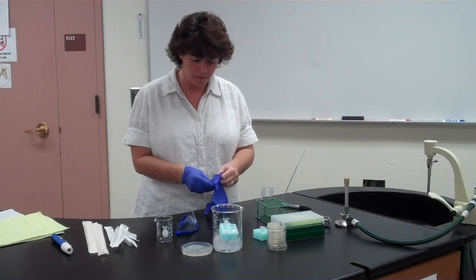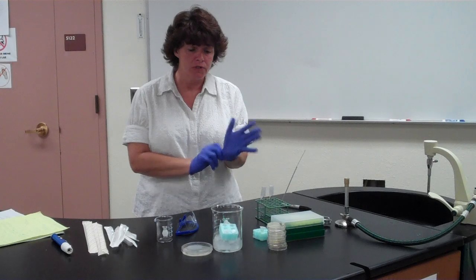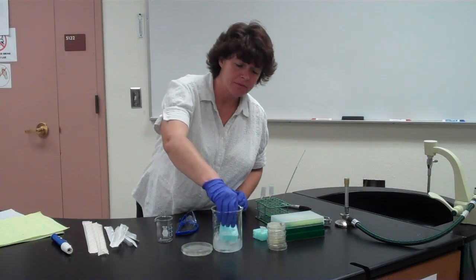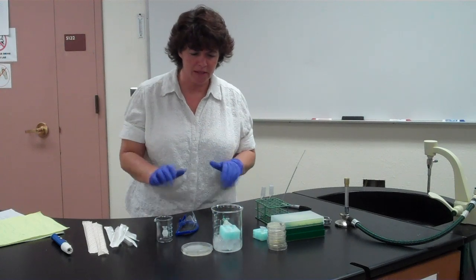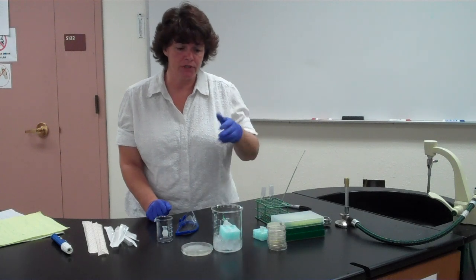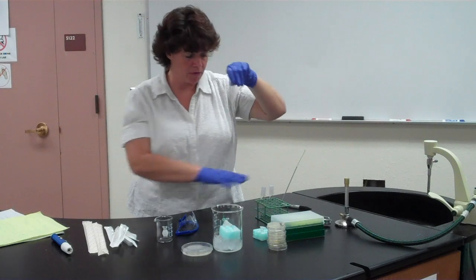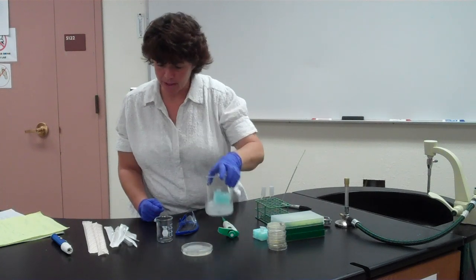Now the solution that we're using is called calcium chloride, and it needs to be kept cold. So when you come to your table or when you get your stuff from your station, the calcium chloride will actually be on ice. You'll have much more ice than this, but I was just trying to keep things minimal for today. It will be labeled CaCl2. It's going to be in one of these little smaller tubes, even though we're putting it into a bigger tube. You're going to need to aliquot 250 microliters.